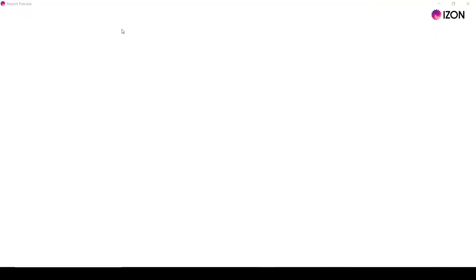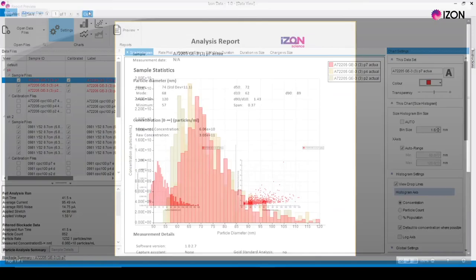To generate a report for the highlighted data set click on the preview button to view a summary of that sample. To create a report with multiple samples click the drop down menu and select group report.